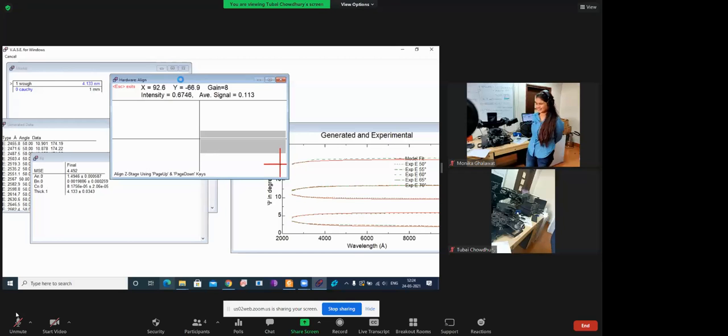Whatever the phase shift is between S polarized light and P polarized light, although they are lying perpendicular to each other, the way they start with respect to each other will tell us the phase shift. For example, one is starting from 0, one is starting from pi by 2. So that pi by 2, that phase shift, will be telling us the delta value. The delta value at the Brewster angle will be near 90 degrees. But around the Brewster angle, there's a sudden change in the delta value from 180 degrees to 0 degrees. Exactly at the Brewster angle, the delta value will be 90 degrees.